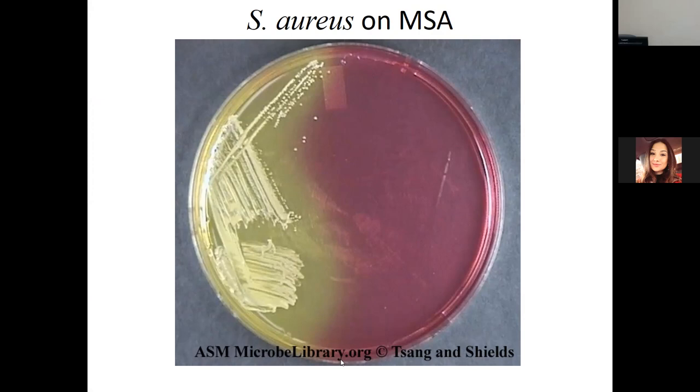No, Staph aureus is the only one that will change color. Where are you getting the sample to put on the plate? Our samples? Yeah, like from the one.